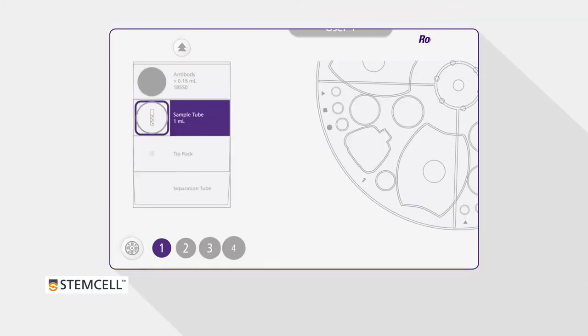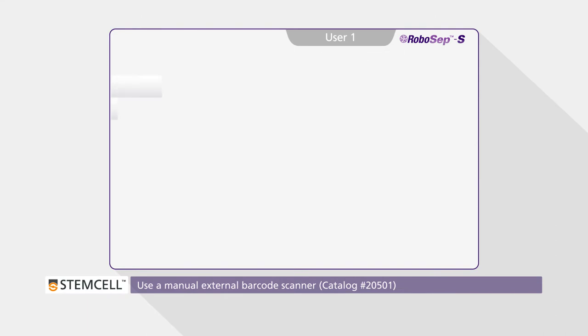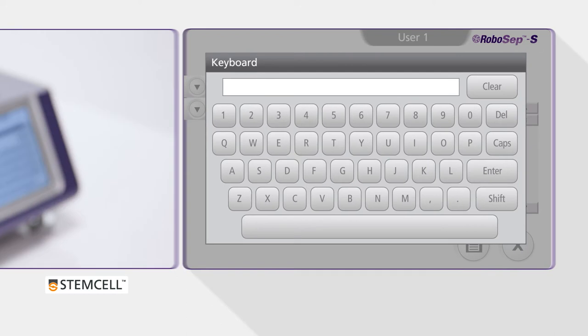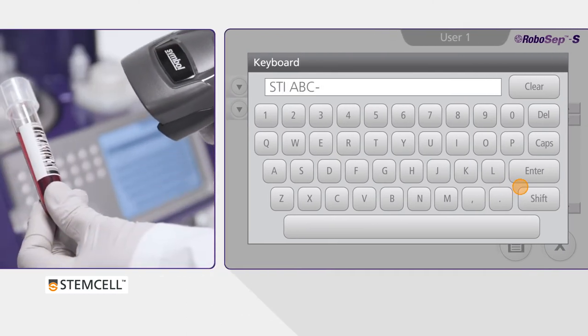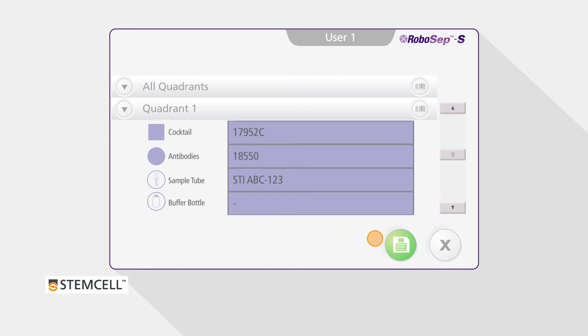If sample tubes are labeled with barcodes, these can be scanned using a manual external barcode scanner. Click on the Sample ID box for the sample tube. Once selected, scanning the barcode with the manual barcode scanner will allow you to record sample-specific information. The same process can be repeated for the buffer bottle as well.